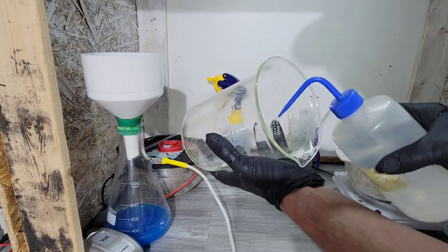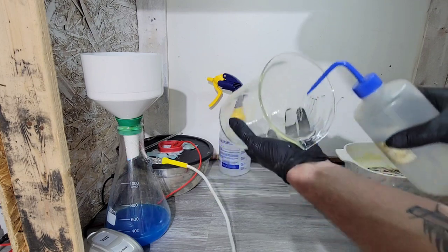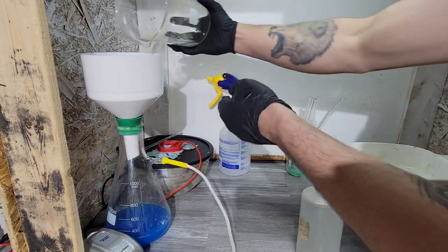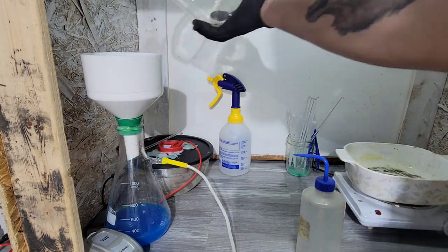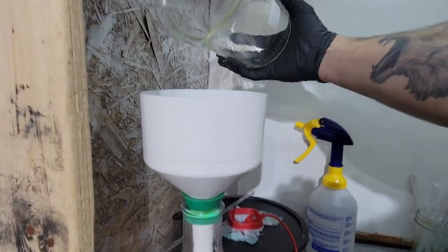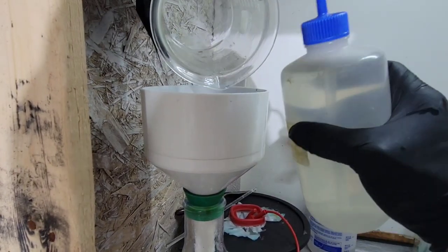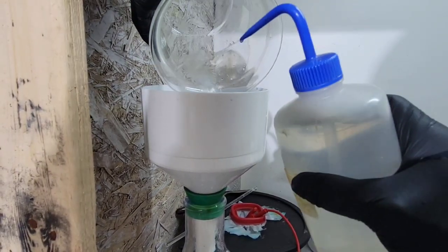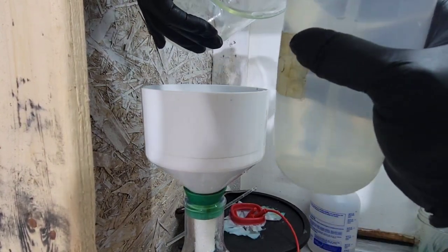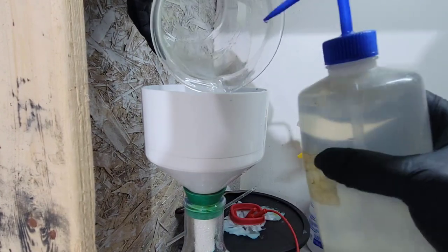So I just ordered a bunch of stuff too. I got another beaker, another flask, another Buchner funnel. What I plan on doing is having a set for hydrochloric solutions and one for nitric solutions so that I don't have to rinse as much.